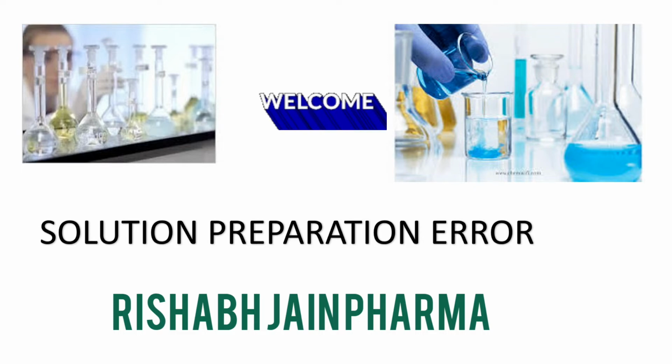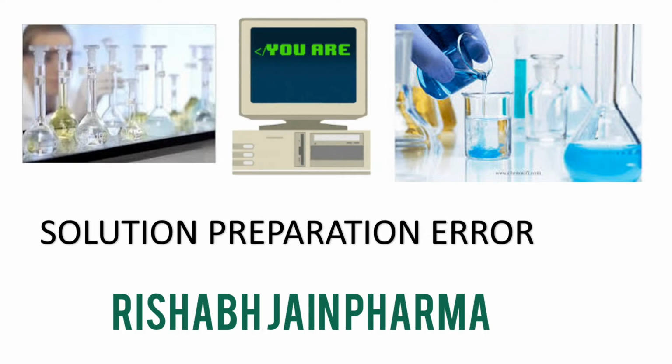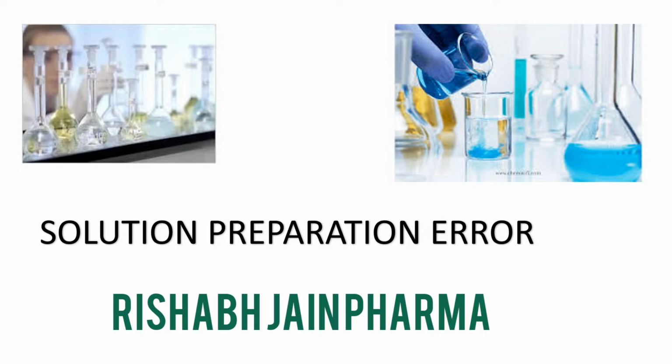If you want to reduce the human error in any industry, then it should be replaced with automation. How much automation there is, how much involvement of the human it reduces, the error will be reduced. But if you go in the QC laboratory in the pharmaceutical industries, there is some area where still there is no automation.